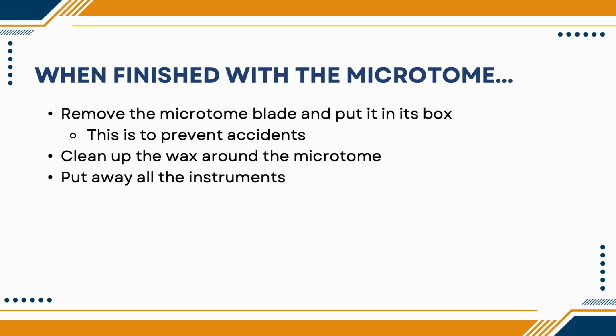And finally, when finished with the microtome, remove the microtome blade and put it in its box. This is to prevent accidents. So what if nakat mo ang sarili mo? Remember that you're handling potentially infectious substances. Then clean up the wax around the microtome. You could use xylene, but the manufacturer would use WD-40, and put away all the instruments.